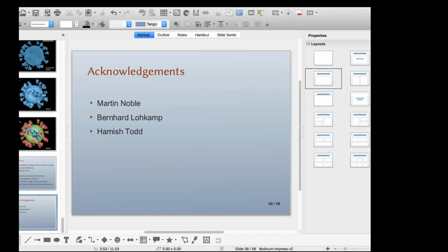Okay. Well, it's worth spending a few weeks on it then. Yeah, exactly. The second question was about compatibility with X-Quartz. I think some people have gotten this X-Quartz issue, but it seems like the latest versions of X-Quartz work with Coot, as far as I'm aware. Does that line up with what you've seen?